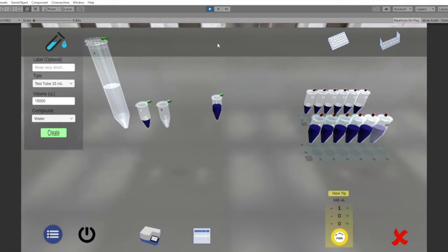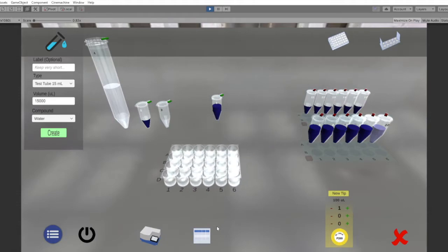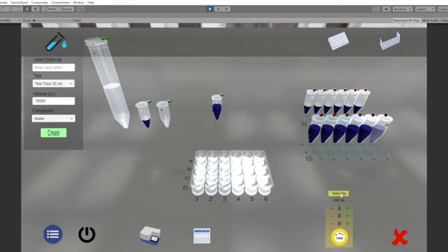So to read our absorbances, we're going to do that on a 24 well plate. So let's create that plate and move it into the field of view. And what we're going to put onto the plate is anywhere between 0 and 40 microliters of that standard solution that we made, because that'll give us between 0 and 40 nanomoles in the well. So let's pop that in.